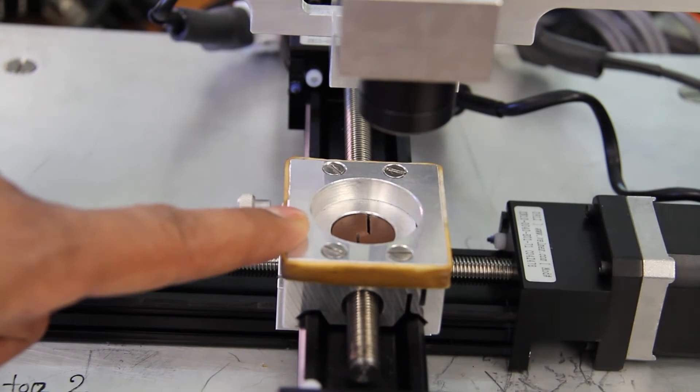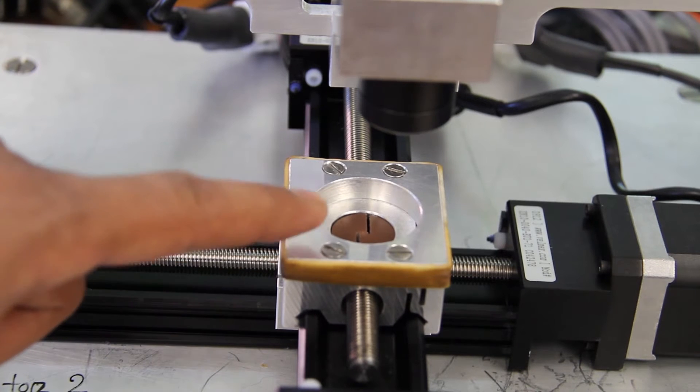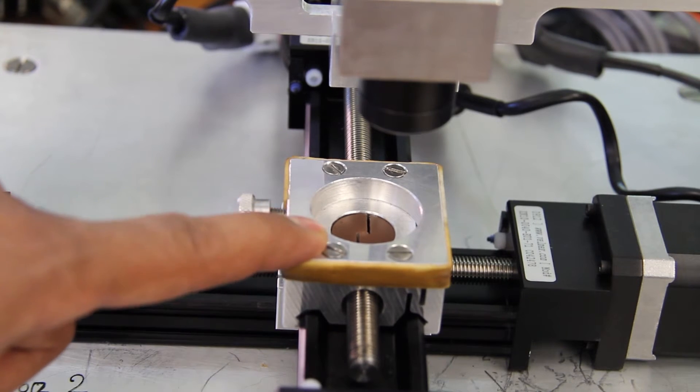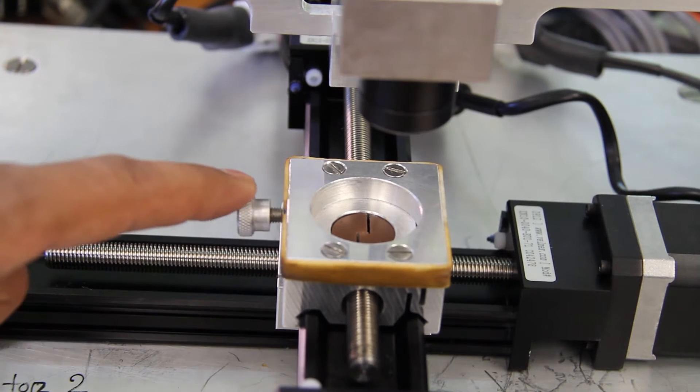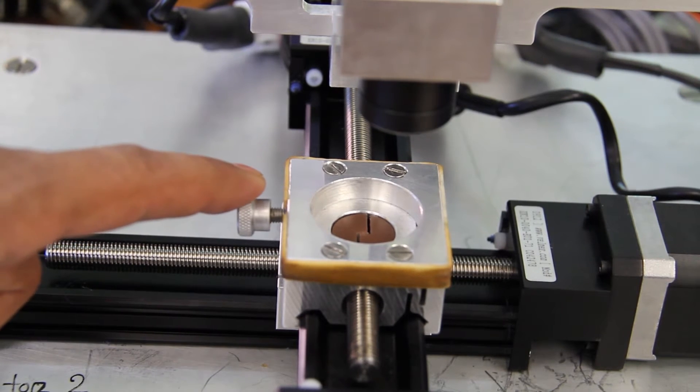This is the sample stage. You can put your sample inside the stage and secure it with the set screw from the left.